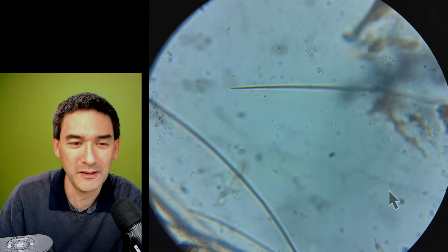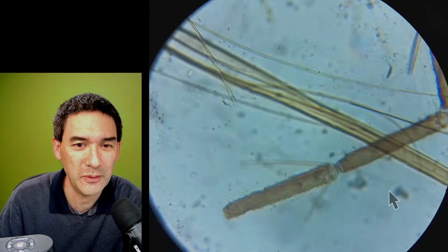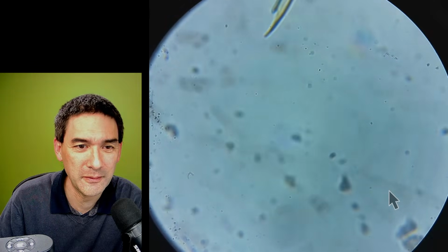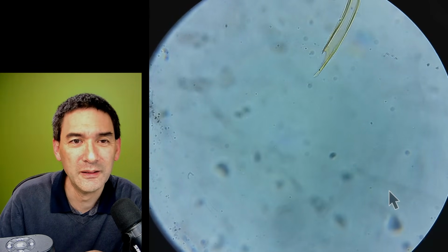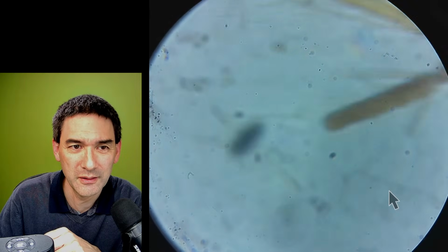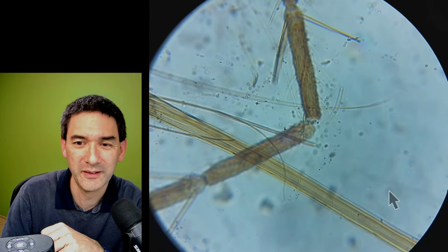You want to have at least part of the head here so that you actually know. It seems to be also broken off a little bit here. I don't know. Yeah, that's basically the mouth parts where it's sucking the blood. But no, not very good.